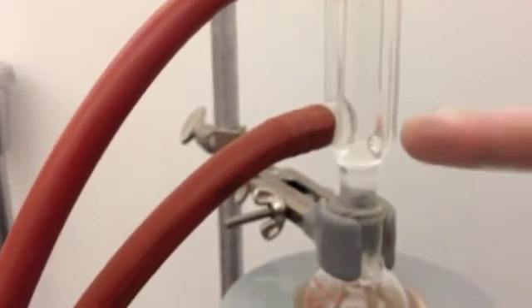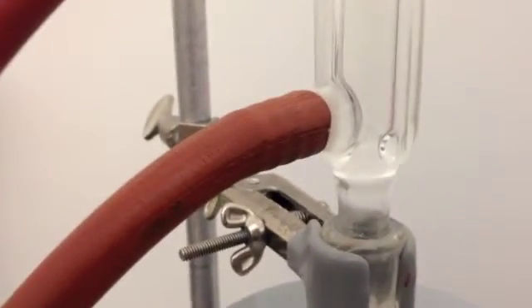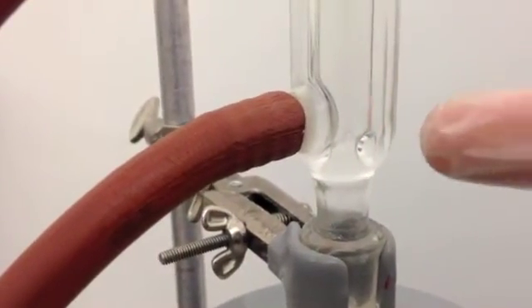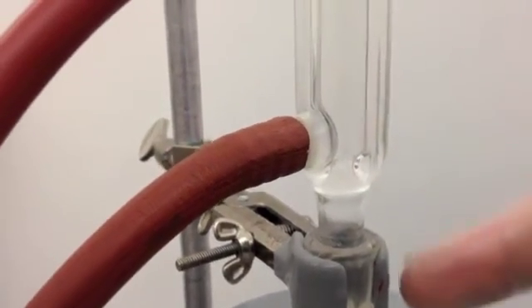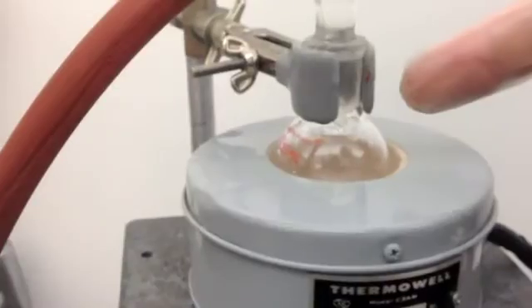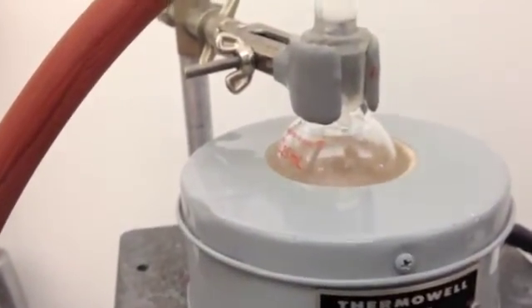And above, you can observe the reflux ring, where the vapors gather, right here, and they condense back and drop, go back to the round bottom flask.